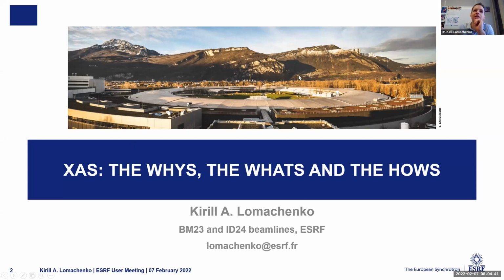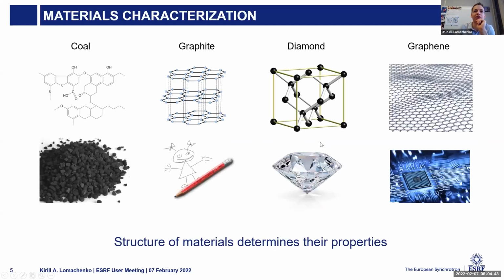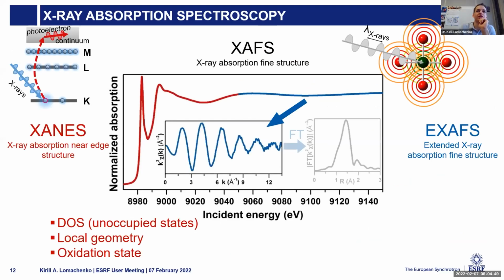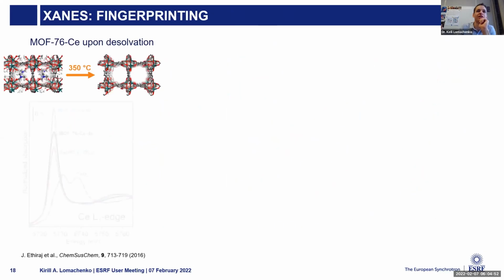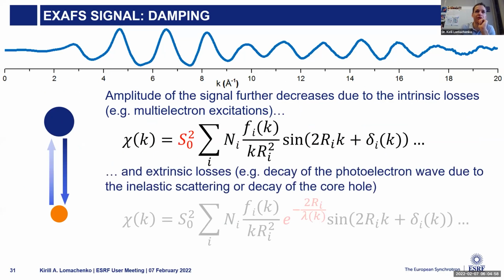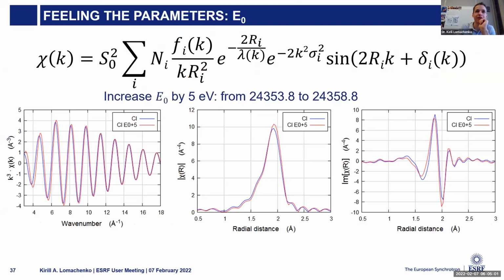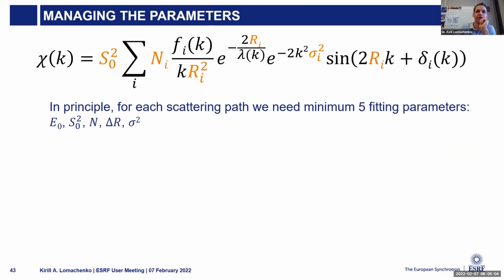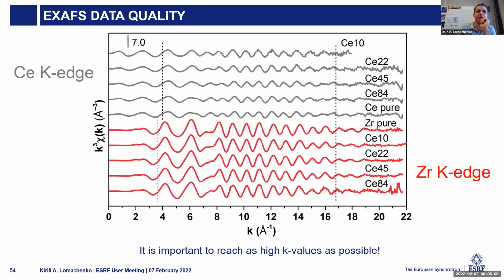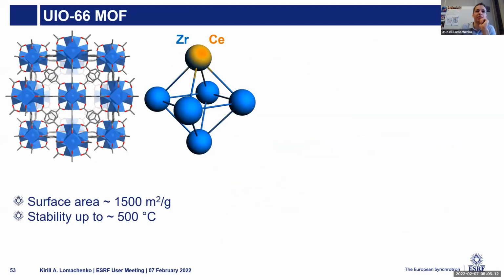Okay, it's about the octahedra. Very quickly, because we are over time already. For this morph, the octahedron is pretty much an octahedron, so all the positions are equivalent, and you cannot distinguish between the apical and the non-apical ones, because they are the same. For different linkers, the symmetry may get distorted, and then you can have the apical different from the equatorial ones.